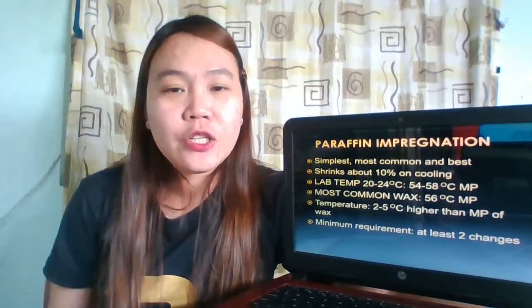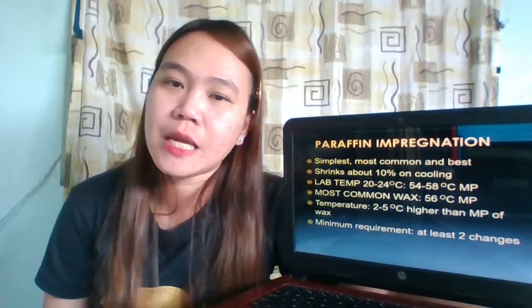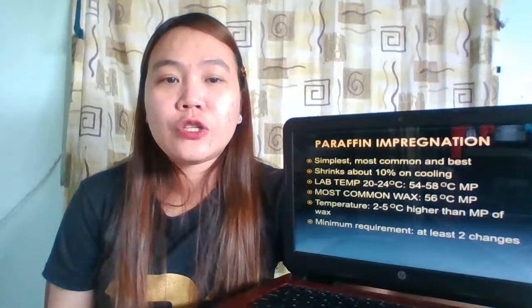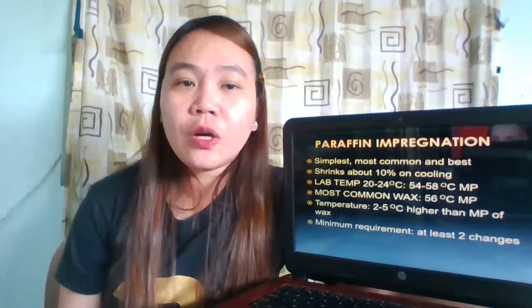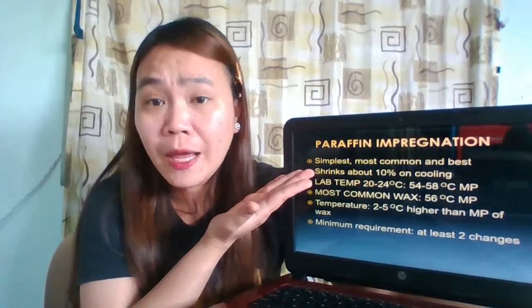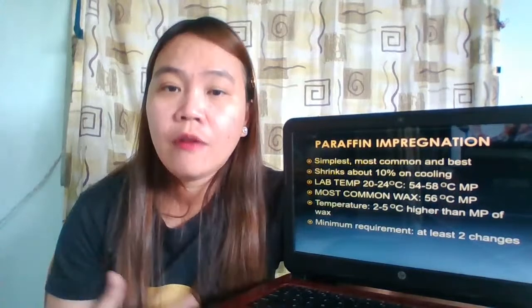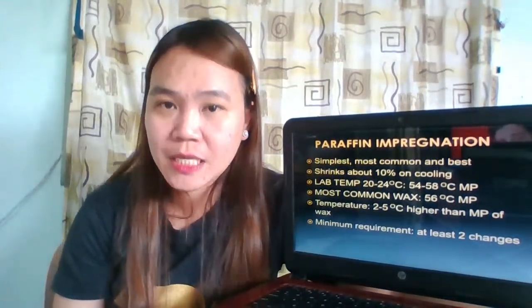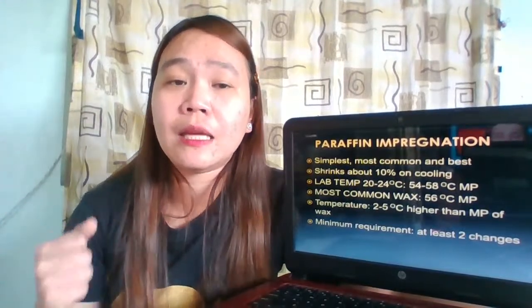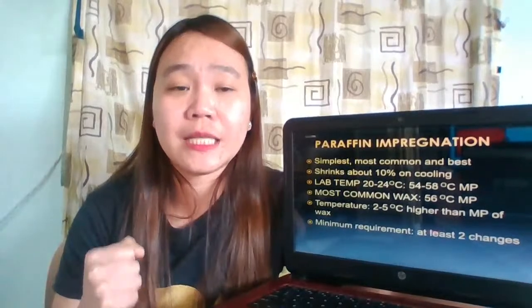First off, we have paraffin processing, paraffin impregnation. Paraffin impregnation is considered to be the simplest. It is the most common and it is the best for routine processing. So I repeat, it is the simplest, most common, and it is the best for routine processing.